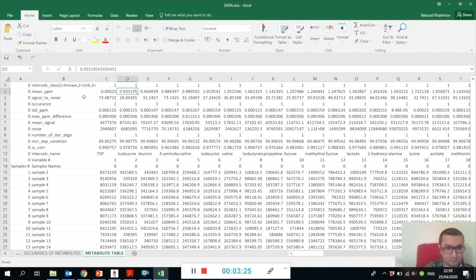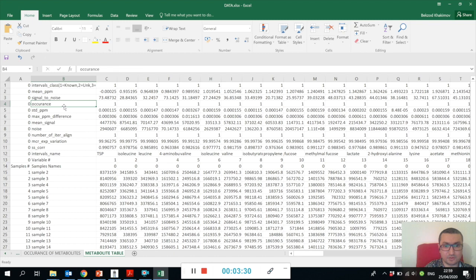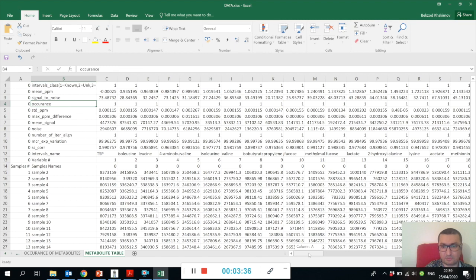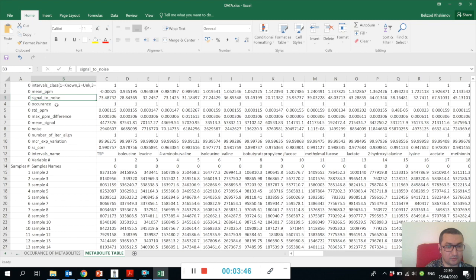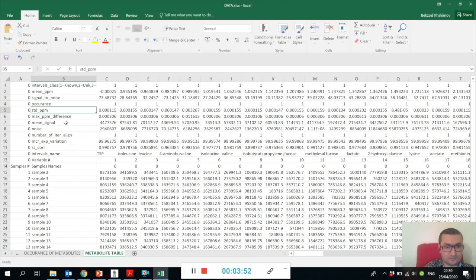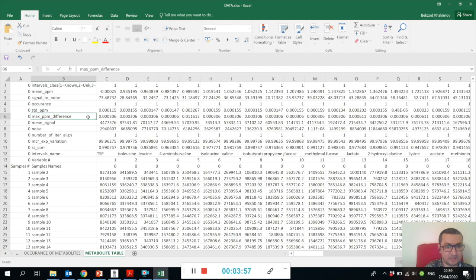You can see we have the metabolite table and we have the ppm of each signal. If it's a singlet, this ppm corresponds to the max of that singlet. We have some signal-to-noise parameters and we have something called occurrence. Occurrence is one if this signal is present in your sample and zero if it is not present. This is calculated based on signal-to-noise ratio - if signal-to-noise ratio is below three, then this becomes zero. We also have some quality parameters about how much shift was present in the data for these specific samples.